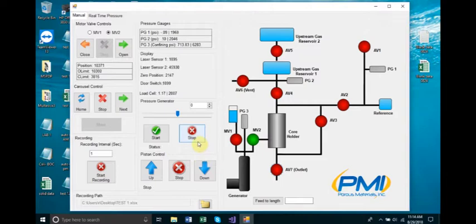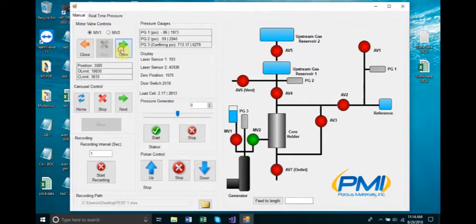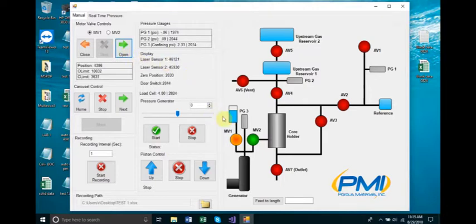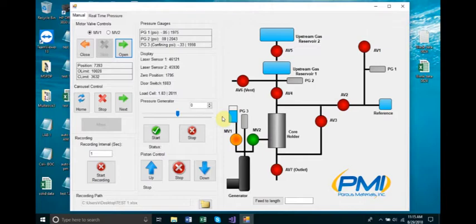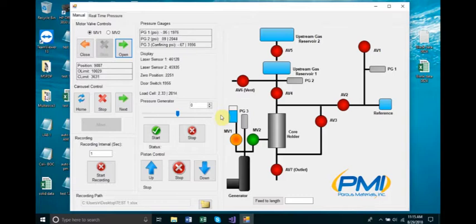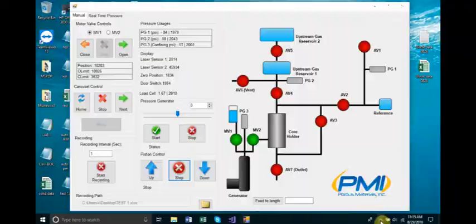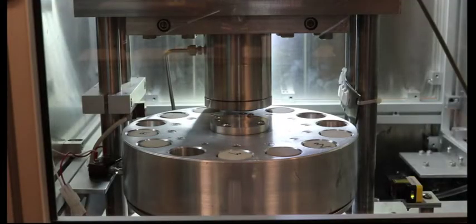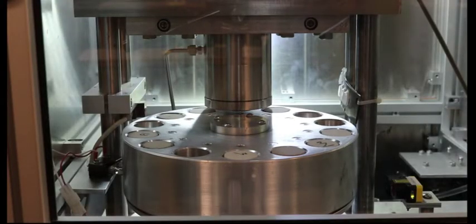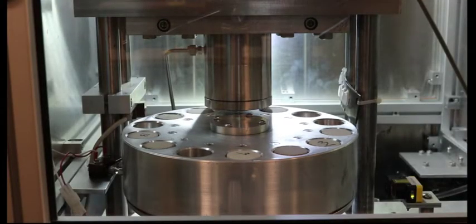To release the confining pressure after testing, move the piston of the generator down and open MV1 to release the confining pressure. Ensure the value for P3 drops to 0 psi. To unload the core sample, in the piston control area, click the down button to lower the pusher rod. The unloading process will be completed once the screw jack stops moving. Click Next to rotate the carousel and continue the test on the sample in the next slot.